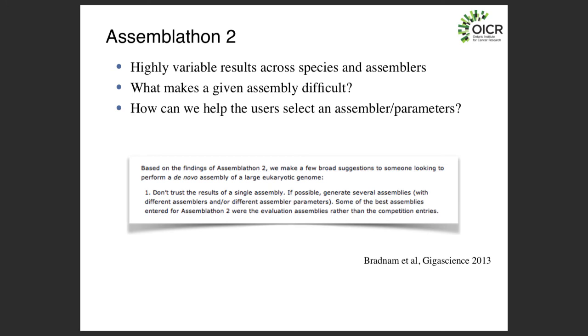Poor quality reads, exactly. If your reads have a very high error rate, it's going to make it more difficult to error correct the data, and it also lowers the effective coverage of your data set. Anything else?